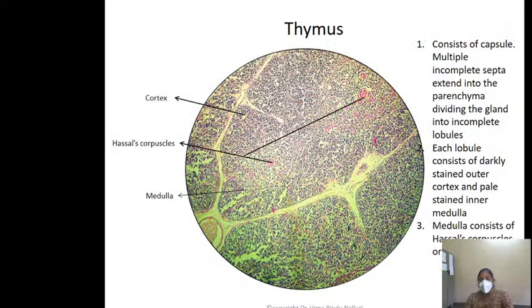It is the thymus. As I said earlier, there is an identification feature for the thymus. When you see lymphoid tissue under the microscope and you are not seeing any lymphoid follicle, then it is the slide of thymus. For the other 3 slides, you see clear-cut lymphoid follicles.